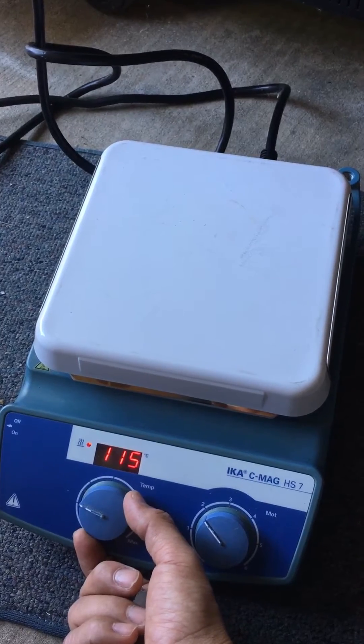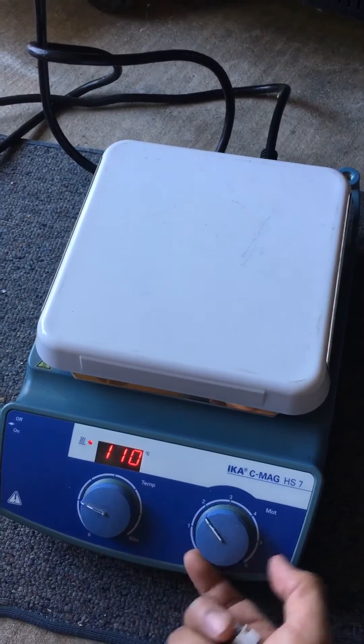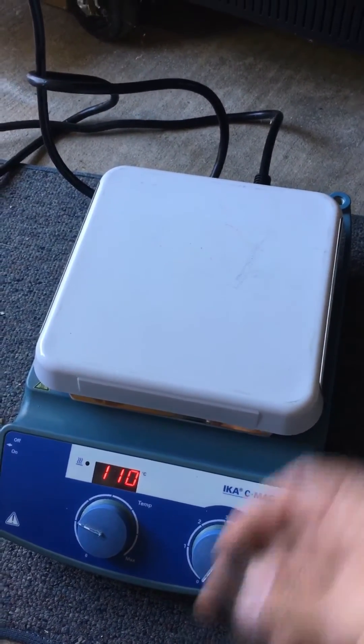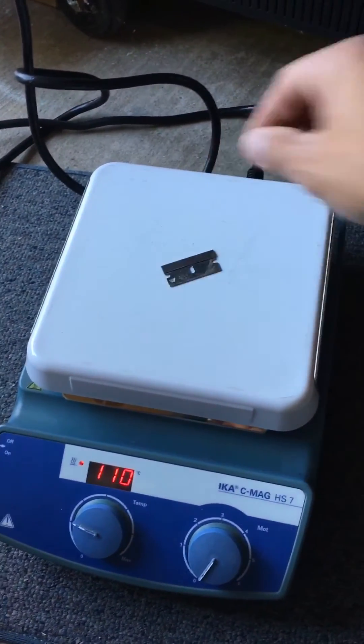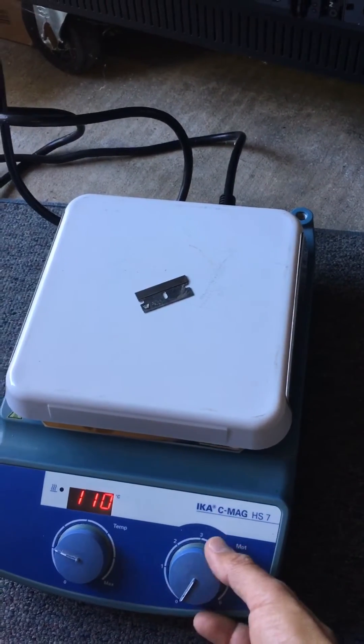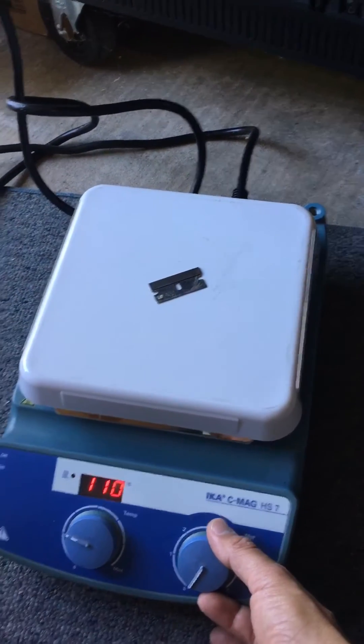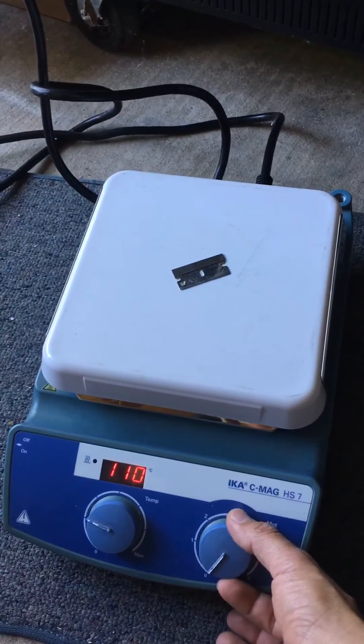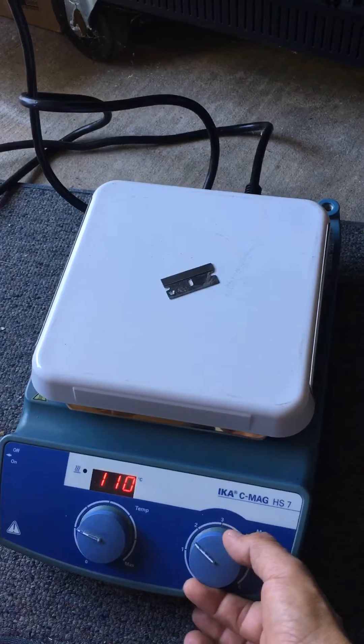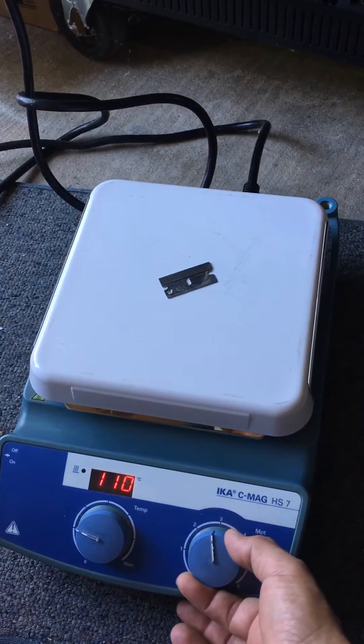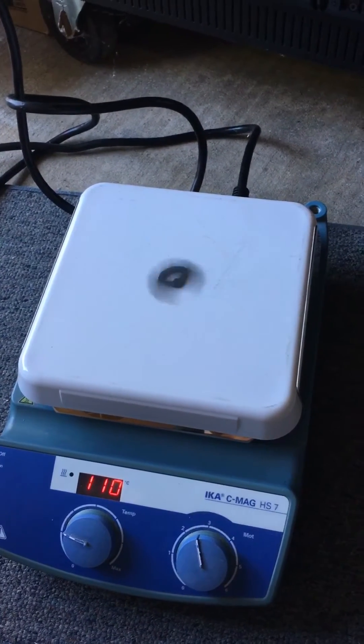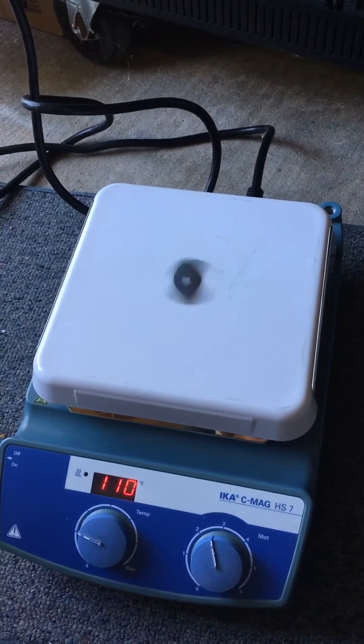I wanted to show you how this works. And of course, the stirrer works like this. That's a magnet - the plate is like a magnet - and then we can just make it turn. You see?